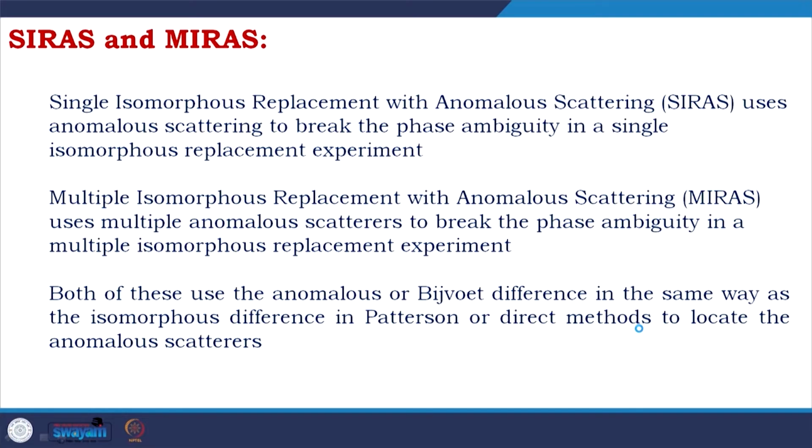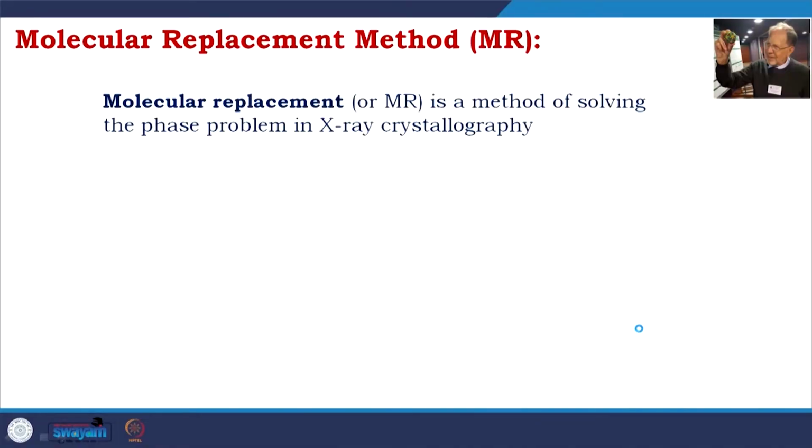We could talk about even more complicated situations where there are caveats, where SIRAS and MIRAS are not used, and we go further, but I stop here because of the time constraint of the course, and I shift to a very important part of solving the phase problem, which is the molecular replacement method. Molecular replacement is a method of solving the phase problem in X-ray crystallography.